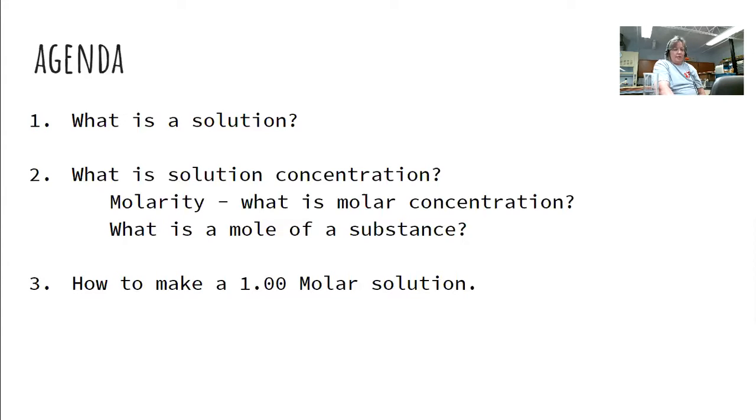And then we're going to talk about what is a mole. If I'm talking about molarity, there must be moles involved, which there are, but it's not the little animal that crawls around in your yard and digs it up. This is different. This is a measurement used in chemistry. Then we're actually going to make a 1 molar solution.